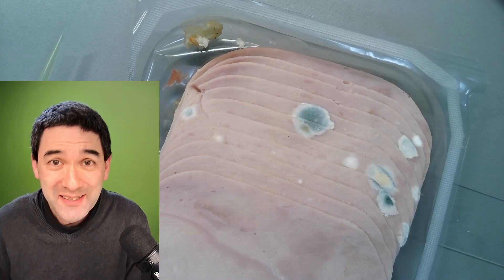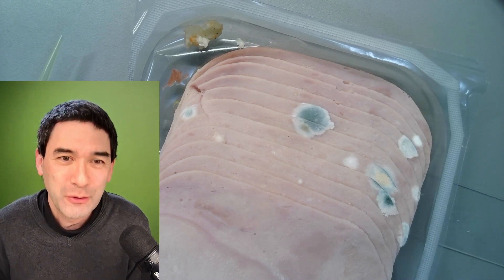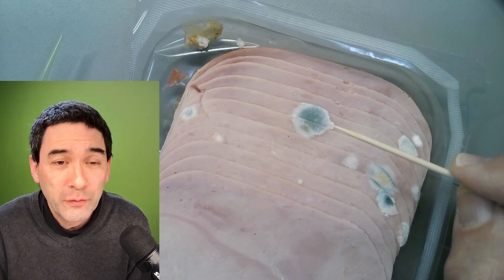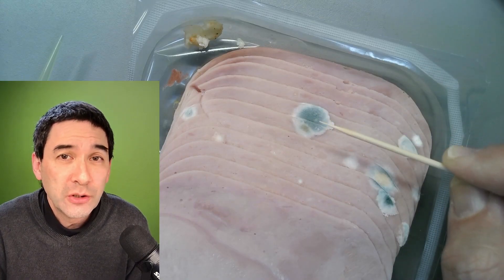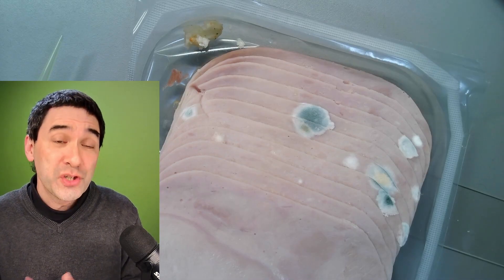You know what I'm going to do now. I'm going to take a sample of the mold and put it under the microscope. Let's have a closer look. This fungal colony over here — you can see it has already turned dark in the center. This one over here as well. It's a sign that spores have already started to form.